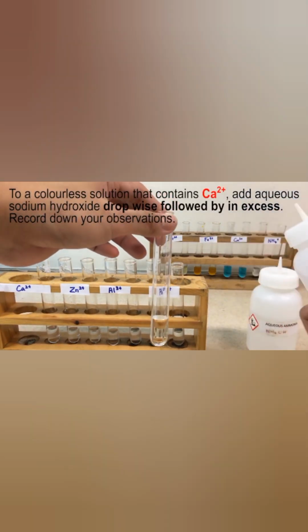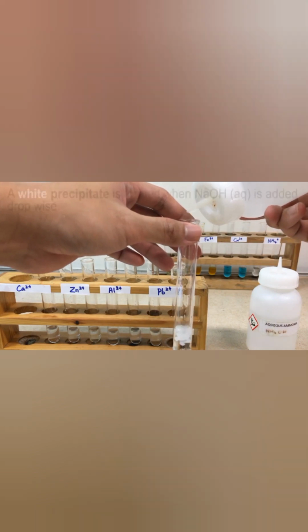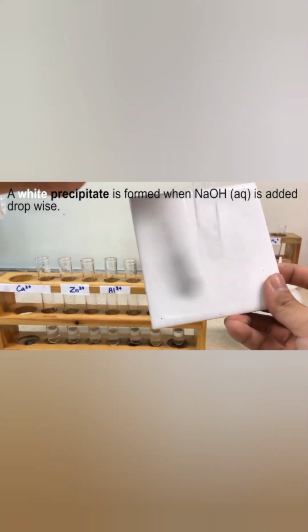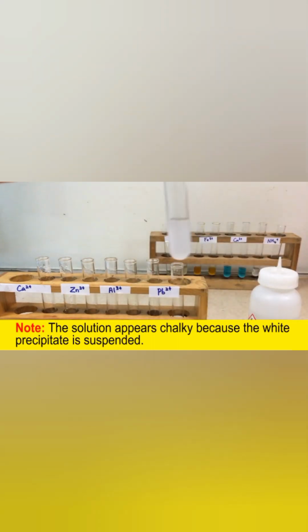When you add sodium hydroxide in drop to a solution containing calcium ion, you will notice that a white precipitate is formed. If you're not seeing it, you could use a white tile so that it will appear. The solution appears chalky because the white precipitate is suspended.